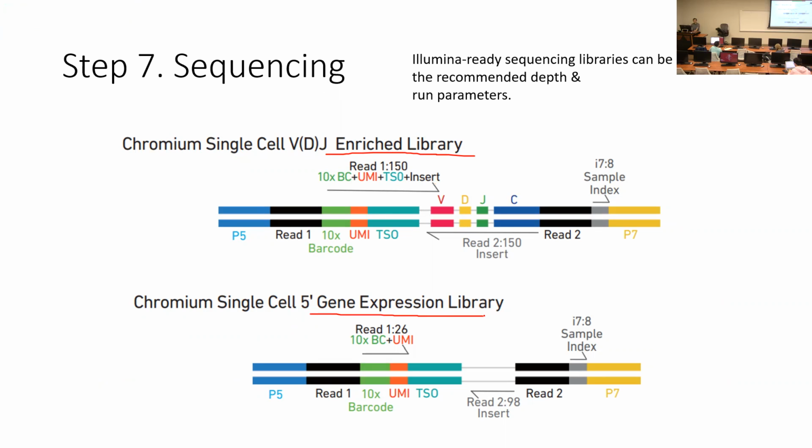So you send this to the Illumina sequencer to get back all the reads, and you can still track down the same cell. Because you have the barcode, you prepared it from the same population of cells, and it's exactly the same cell because you labeled it, but they only separated their amplified products, right?